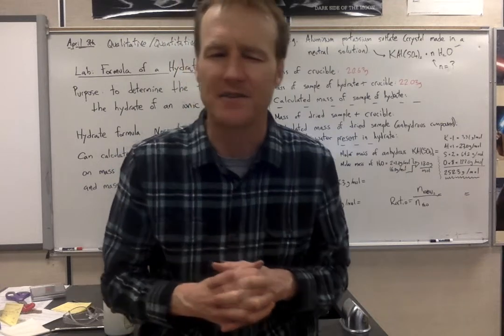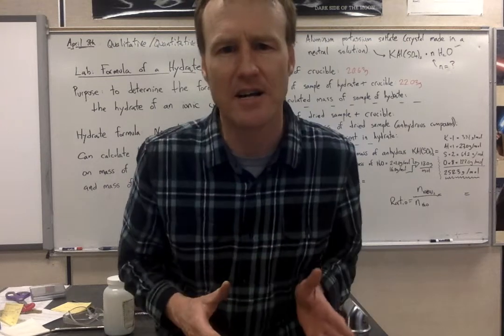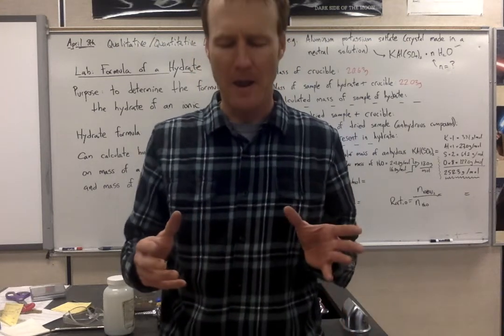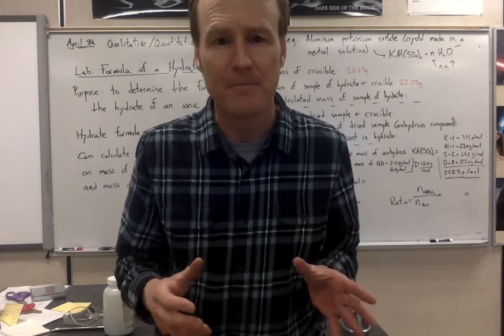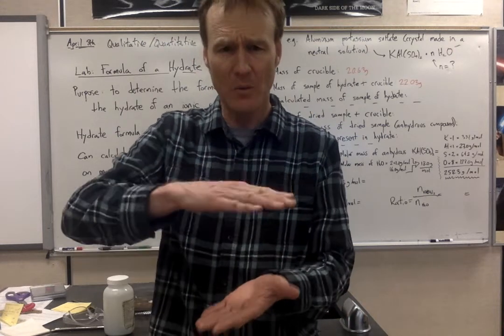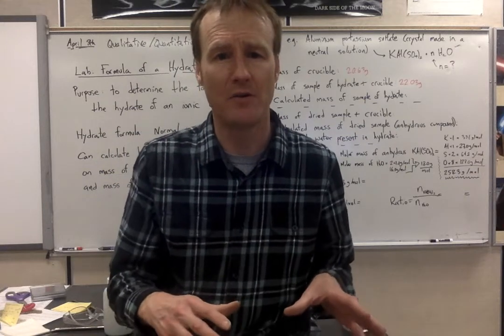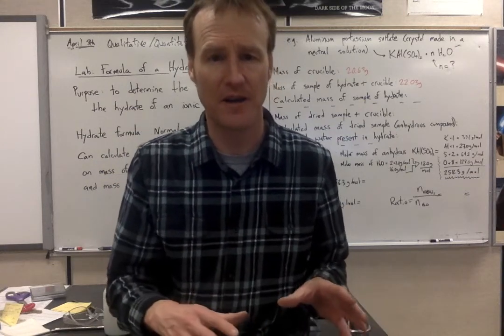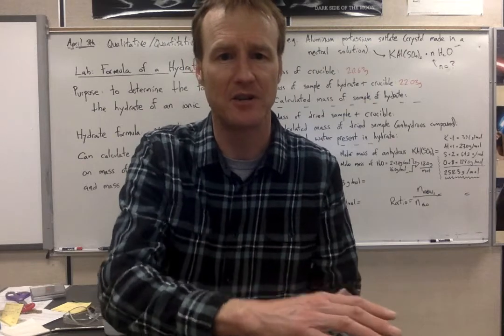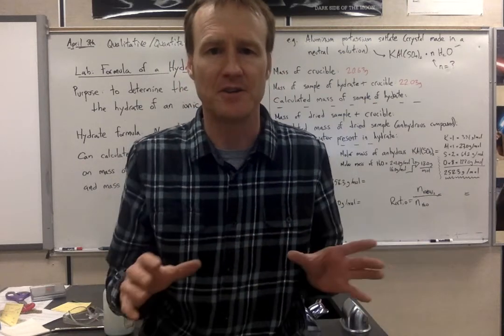Now, the thing is this. What you can do is you can take that material. This is a common science fair project. You can boil it, and then you can let it sit. And what happens is crystals will form at the bottom of your vial after you've done that. If you've made what's called a supersaturated solution, crystals will form at the bottom, which is very pretty. You get these big crystals.